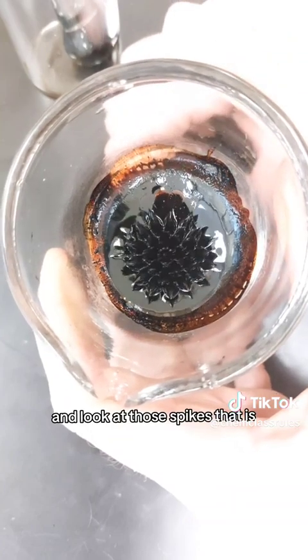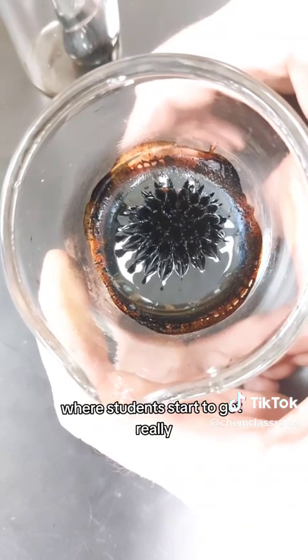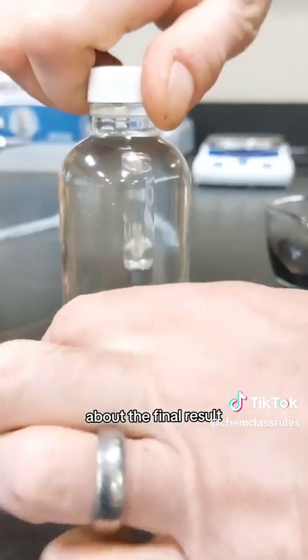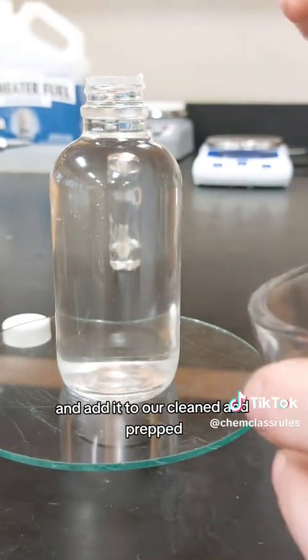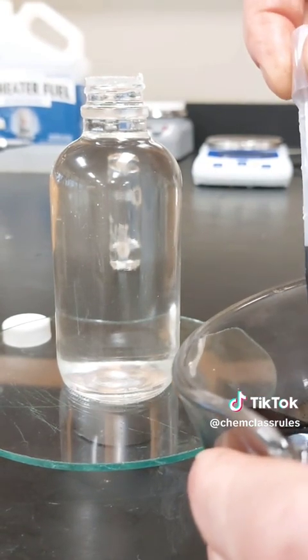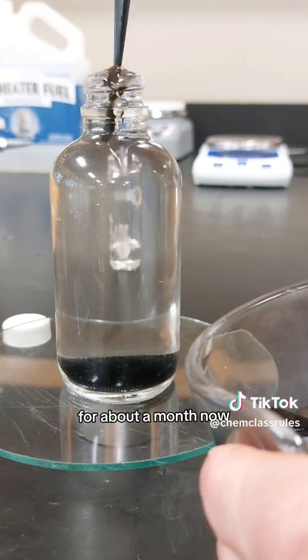Look at those spikes — that is phenomenal! This is actually the part of the project where students start to get really, really excited about the final result. Now we're going to go ahead and add it to our cleaned and prepped glass storage jar. Remember, that storage jar has been sitting with a saturated salt solution in it for about a month now.